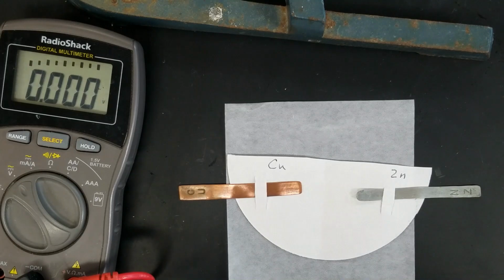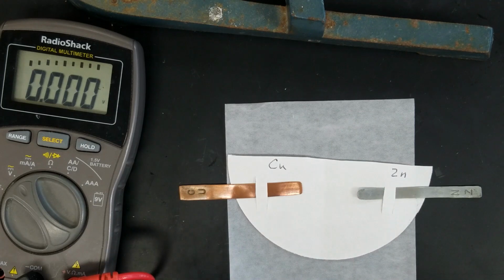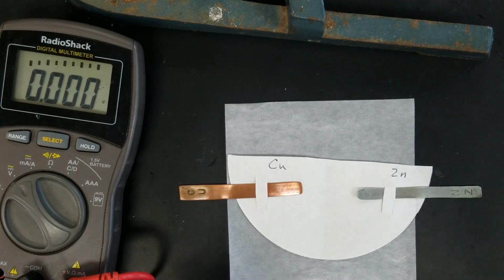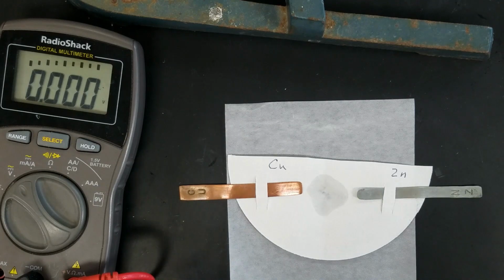We're now going to talk about electrochemical principles. We're going to build tiny galvanic cells using filter paper and a few drops of solutions. The reason that we're doing it on this small scale is to be more green and environmentally friendly by reducing the amount of waste that is produced. Just like in a galvanic cell, we need to add a salt bridge in the middle to allow our ions to flow.